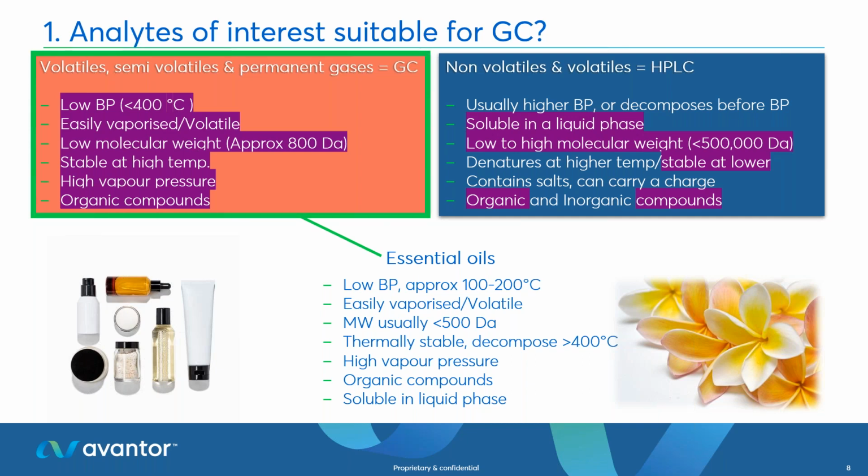So this is a good way to just double check what you're actually analyzing. And yes, you might be able to do it on HPLC, but GC is also there because it's a very specific analytical technique and we need to take advantage of it.